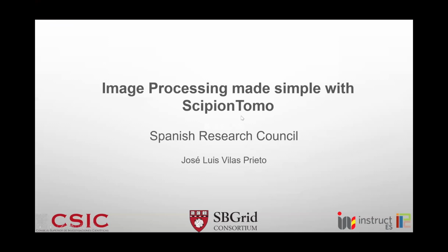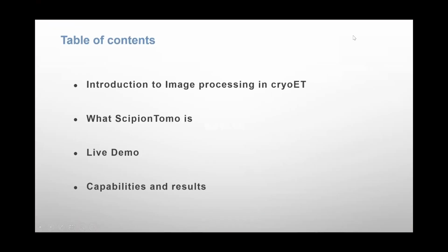Yes. Okay, good. So, as Estrella said, I'm José Luis Vilas from the Spanish Research Council, and I lead the tomography developments in the lab, and particularly with this software that we are developing, which is Scipion for tomography. And during this talk, I will address this topic.